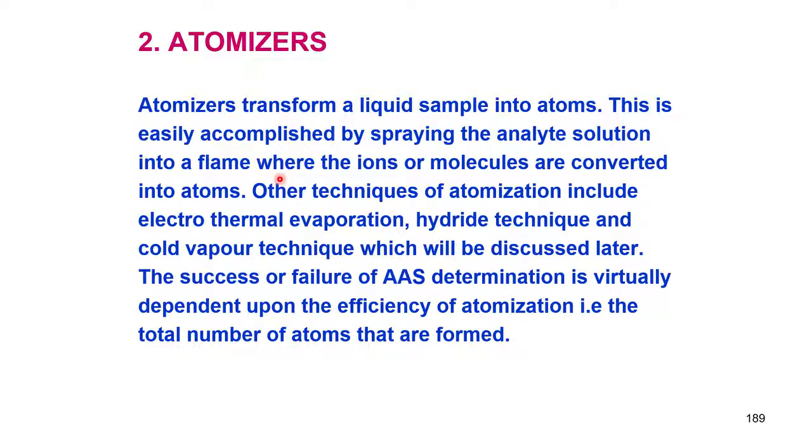No, the answer is no. There are other techniques of atomization: I can heat it, electrothermal evaporation, I can produce hydride generation, which I had mentioned a little earlier, and there is a cold vapor technique, which we are also going to discuss later. The success or failure of an atomic absorption determination virtually depends upon the efficiency of atomization. So, the total number of atoms that are formed determines the sensitivity.